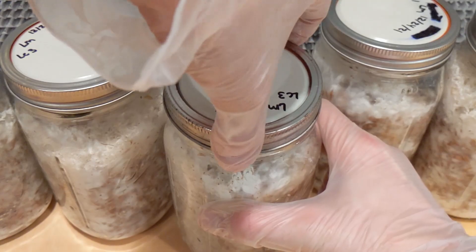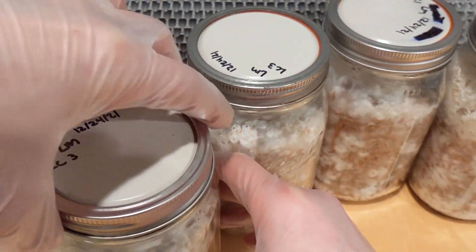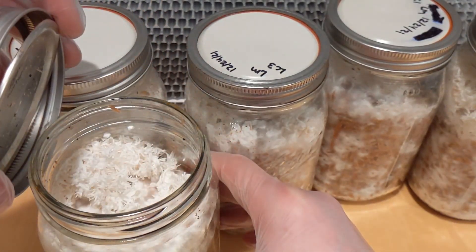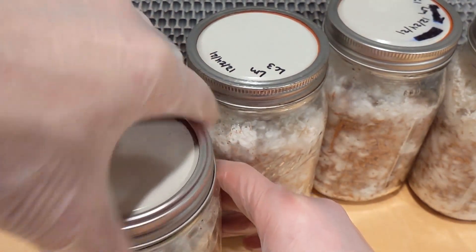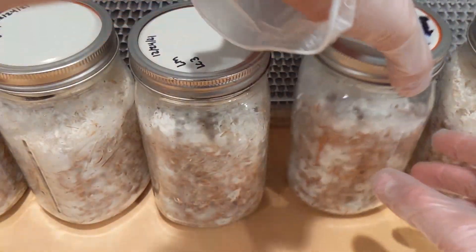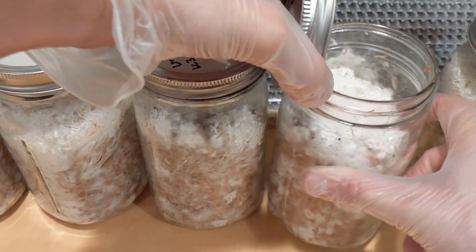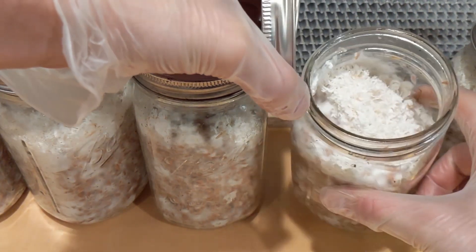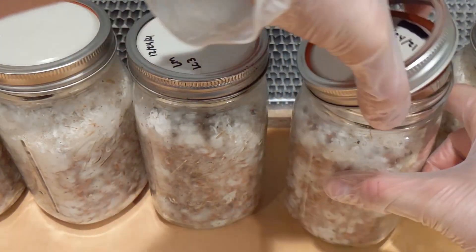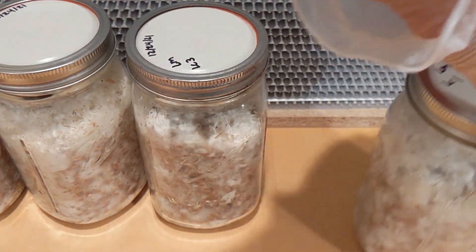I'm just kind of deciding which ones I'm going to use — like adding three over one. They're all kind of gorgeous.